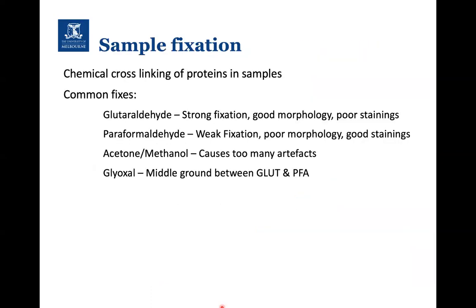All right, so that's as deep as I want to get on the live cell imaging. We'll now go into sample fixation, and there's again a number of different avenues we can go down. So we'll go through each one in turn through the next slides. I guess the main kickoff point here is how we're fixing the samples and what fixing, in quotation marks, does.